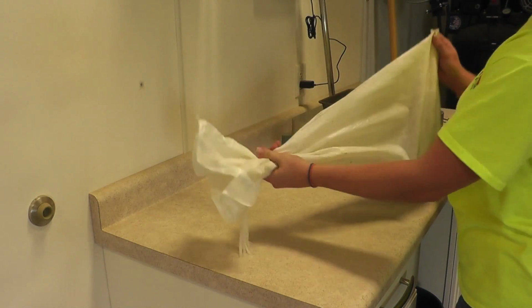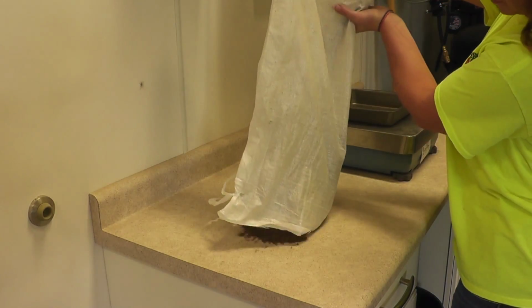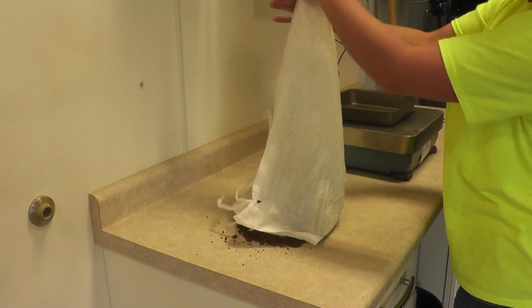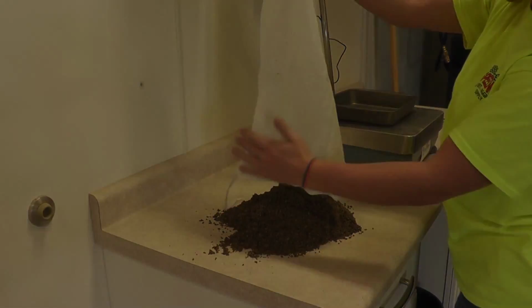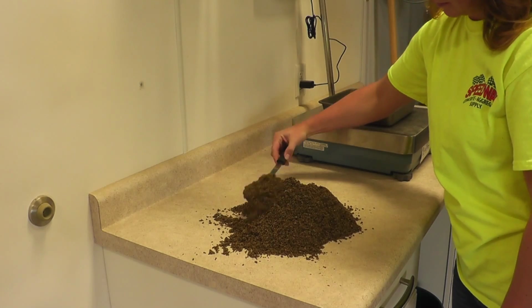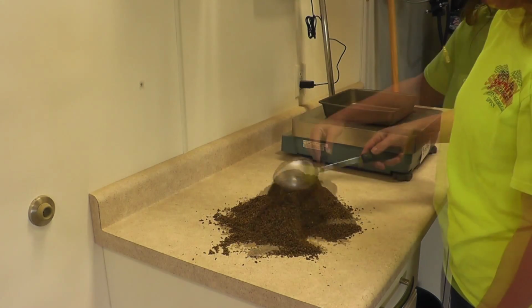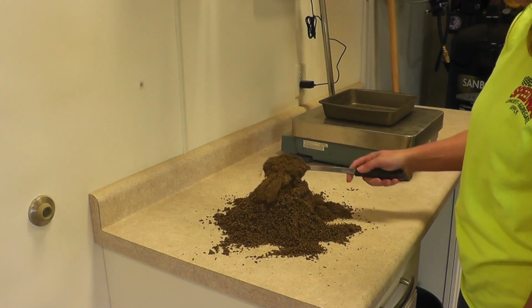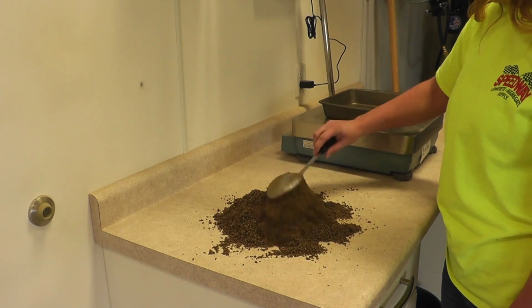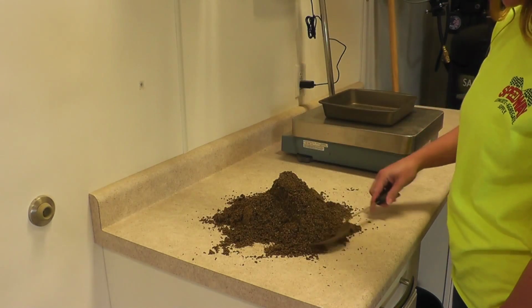Place the field sample on a hard, clean, level surface where there will be no loss of material or contamination. Mix the sample by turning the entire sample over 3 times with a shovel. With the last turning, shovel the entire sample into a conical pile by depositing each shovelful on top of the preceding one.